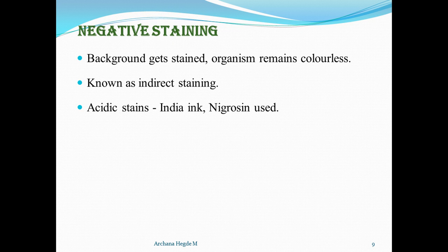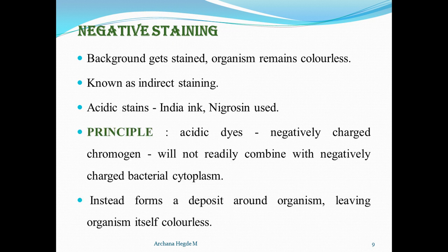These stains are acidic stains, for example Indian ink and nigrosin. Coming to the principle, these are acid dyes. Negatively charged chromophores will not readily combine with the negatively charged bacterial cytoplasm. Instead they form a deposit around the organism, leaving the organism itself colorless.